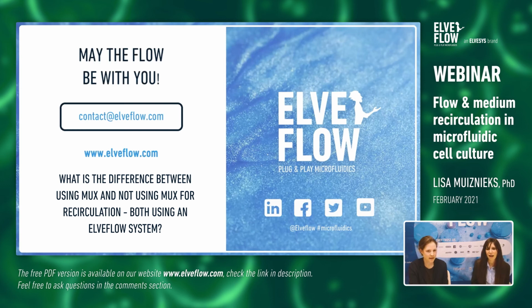Well, actually, both systems can work. Of course, it is a matter also of organizing your space on your bench as well. So the MUX gives a more compact solution, and I would say probably easier to set up.